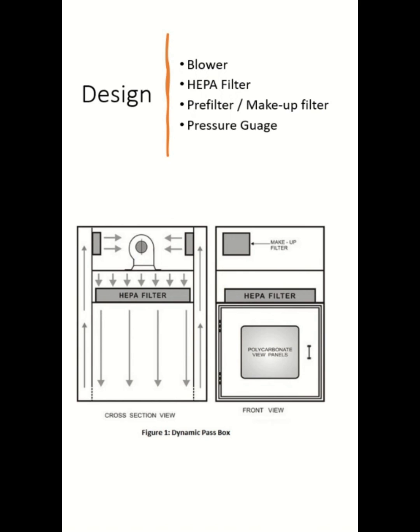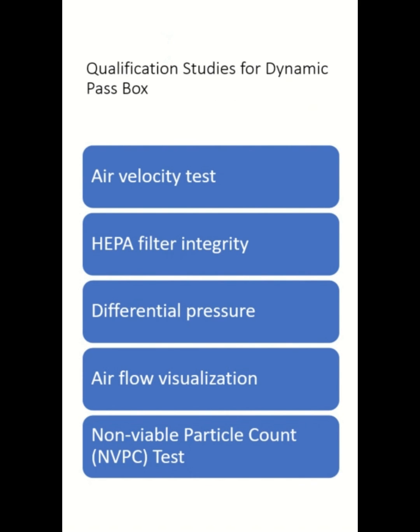And if you want to talk about the qualification of the pass box, these are the major tests that need to be performed when you want to qualify the dynamic pass box: air velocity test, HEPA filter integrity, pressure differential, airflow visualization, and non-viable particle count.